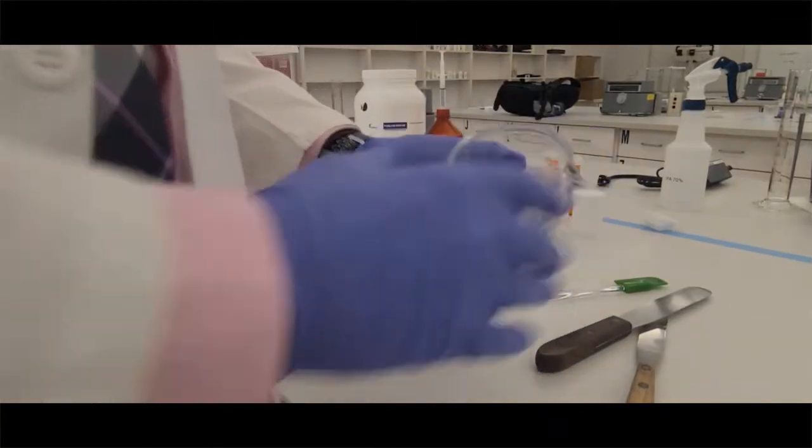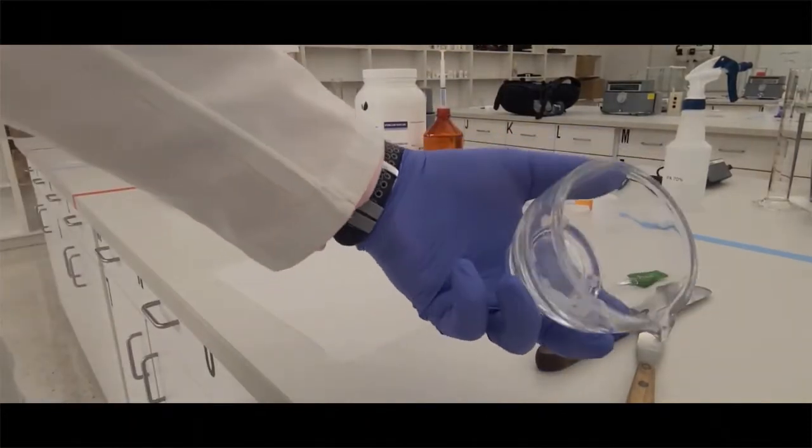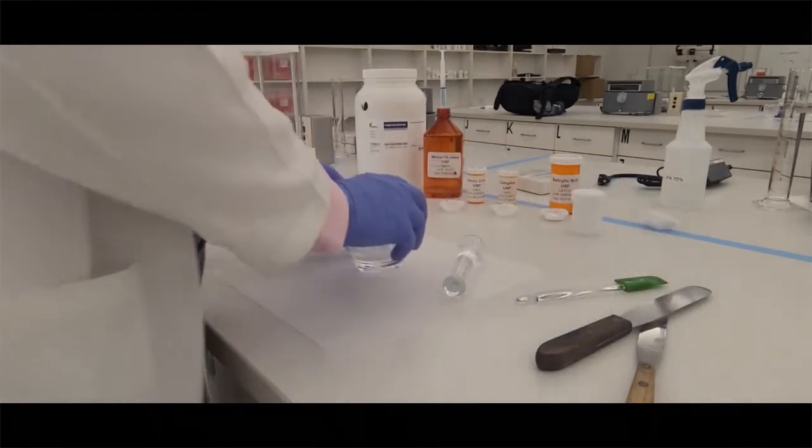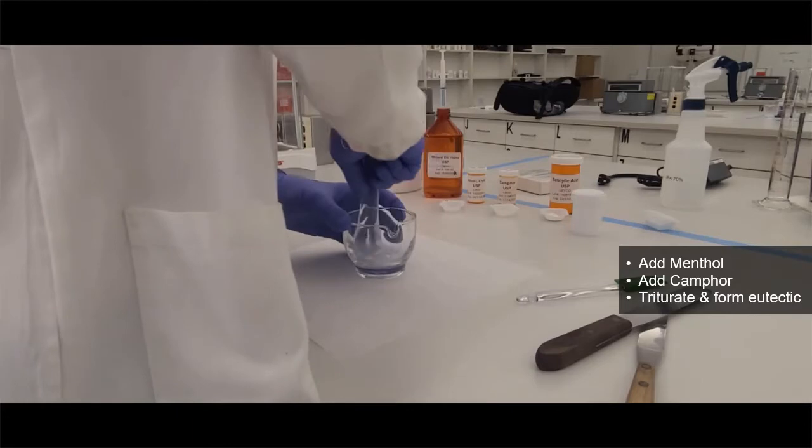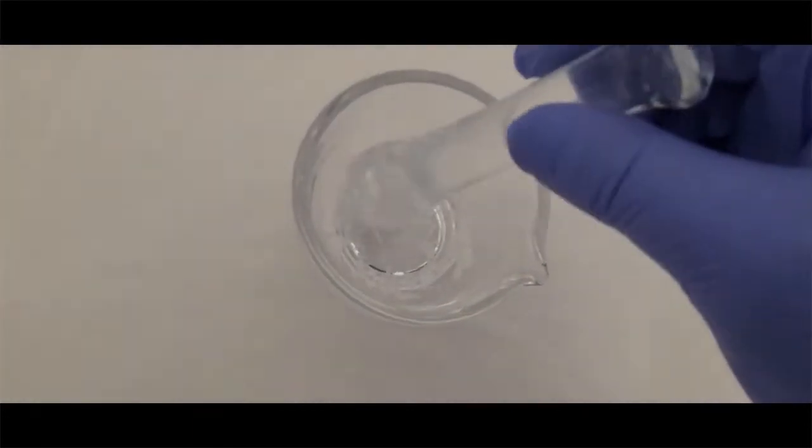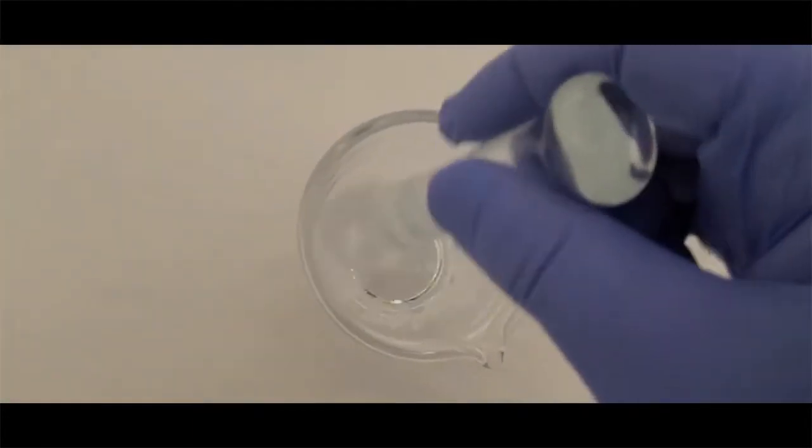So when you incorporate those into an ointment or cream, they're going to act very gritty. So here we're going to make the eutectic. You'll notice that I'm going to take the mortar and pestle and start triturating them. As I triturate them, and you'll see in this close-up shot that they start to liquefy. They almost turn into a syrup.